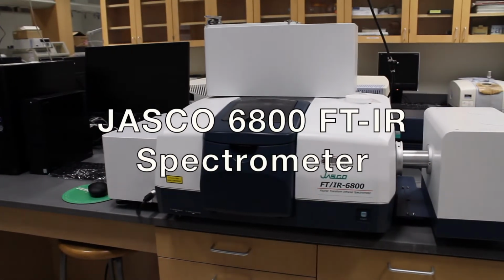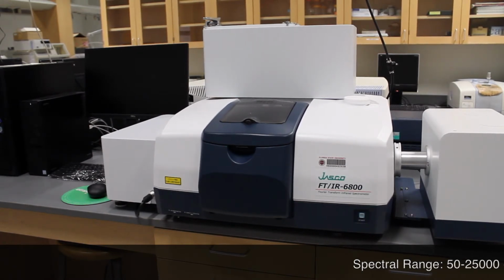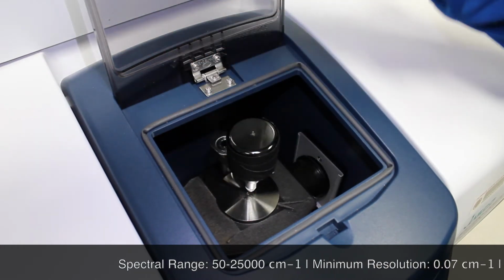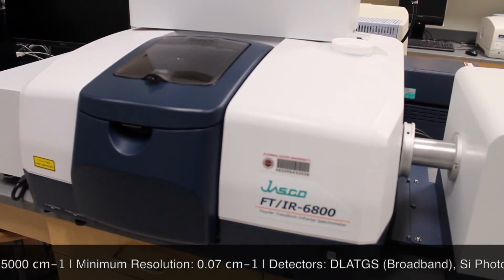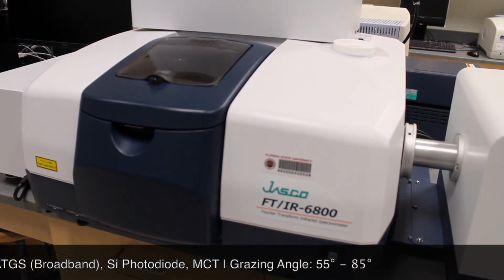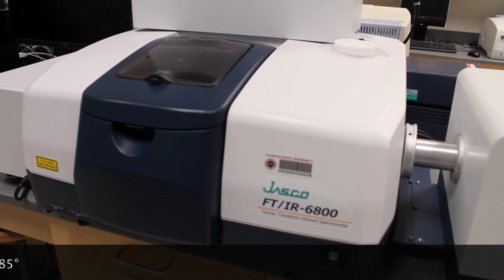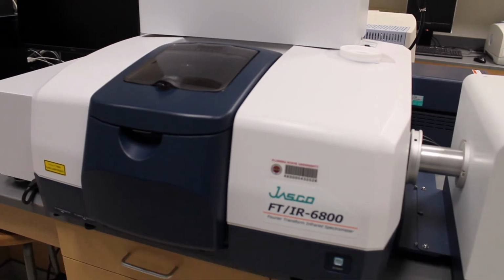Our Fourier Transform Infrared Spectrometer, or FTIR, is equipped with different light sources and detectors that enable measurements from the visible to far infrared regions. The infrared spectra give structural insight to a sample. An attenuated total reflectance, or ATR, sample chamber consisting of a monolithic diamond crystal with anti-reflectance coating is used to characterize samples in many forms, including solids, powders, liquids, and pastes. In addition to ATR, the instrument also has transmittance, grazing angle reflection, and diffuse reflection accessories.